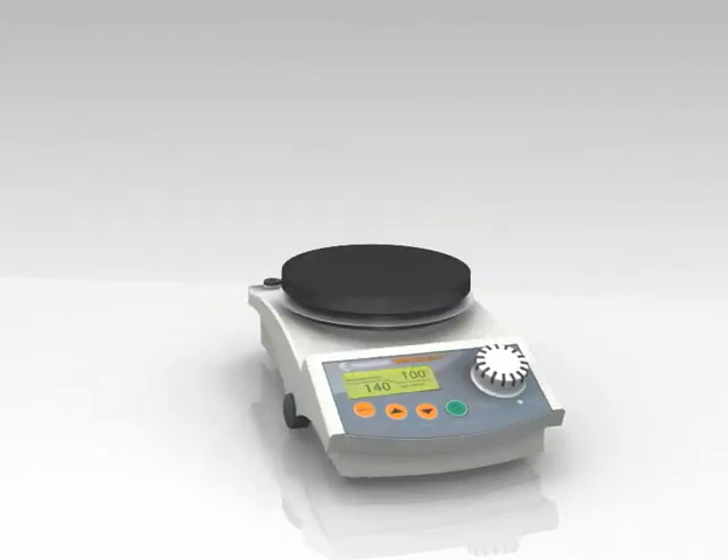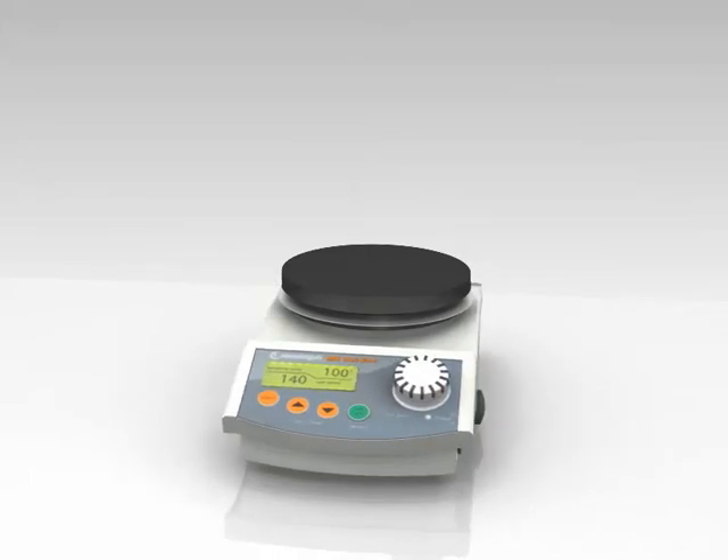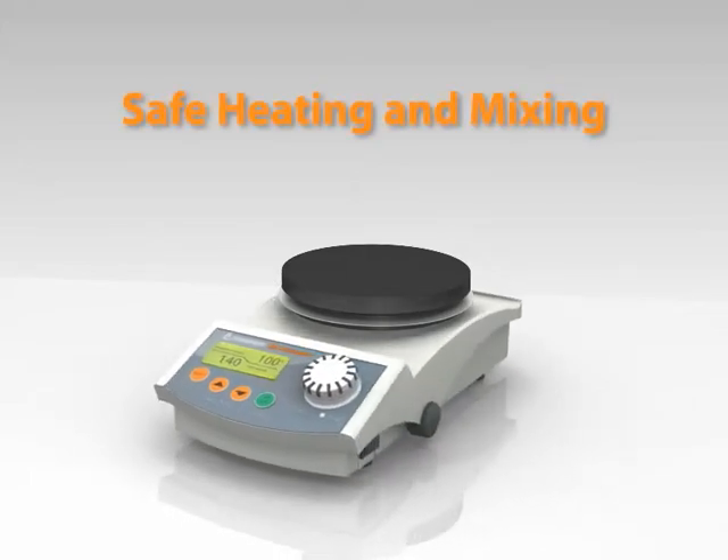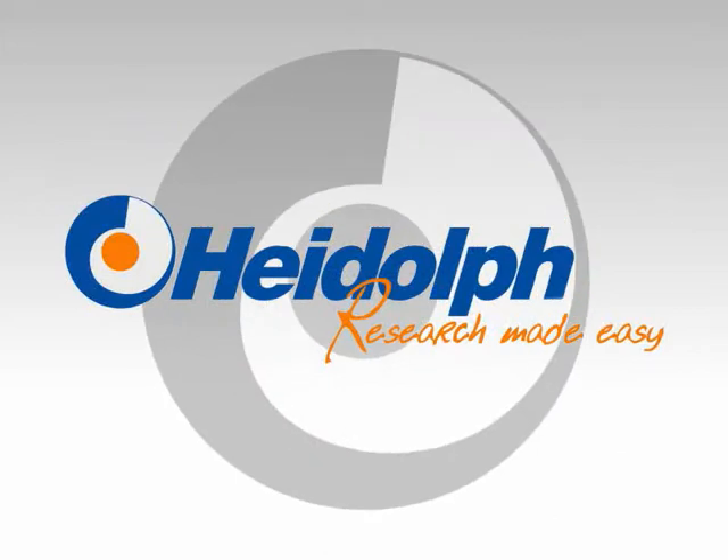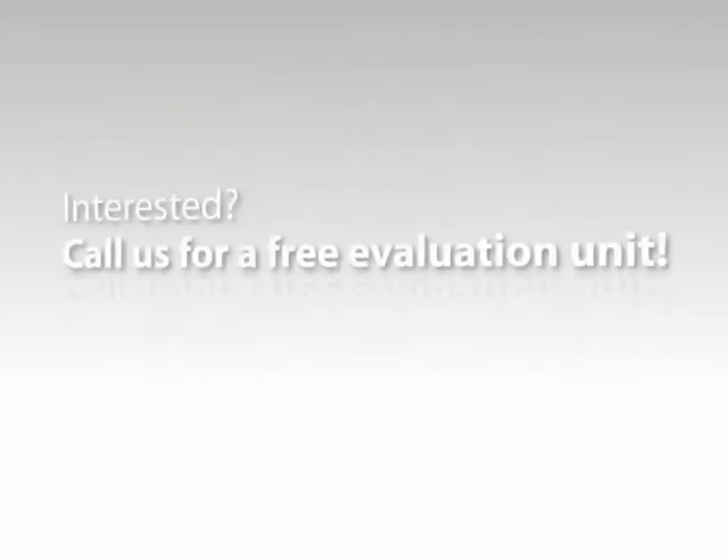Magnetic stirrers with heating — safe heating and mixing. Interested? Call us for a free evaluation unit.